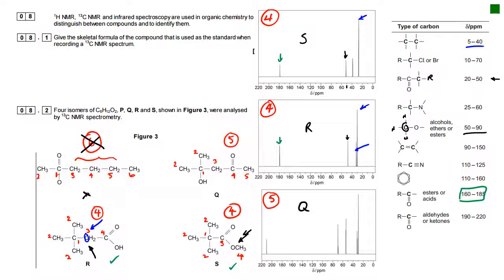And in S you see there's no CH2 between the carbons there. So that would suggest further that this is R. Okay, so we've got a little bit more evidence there. So there we go, let's move on.